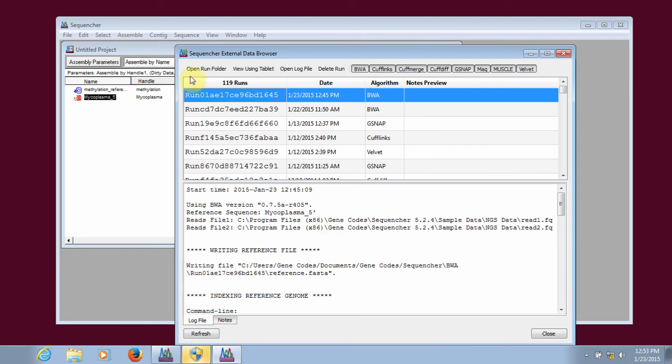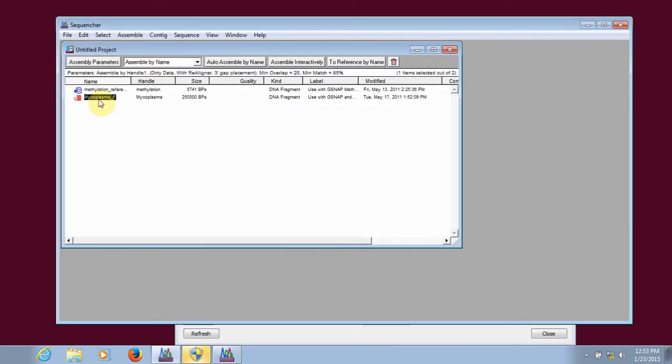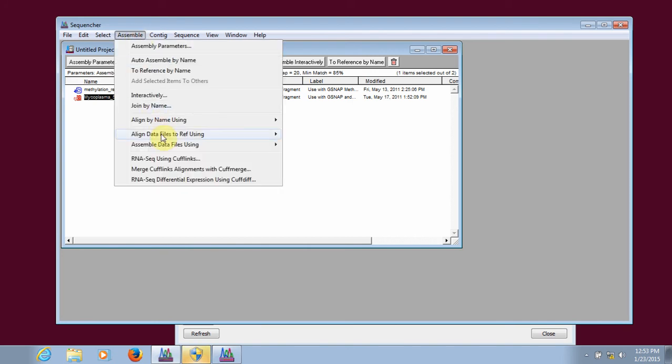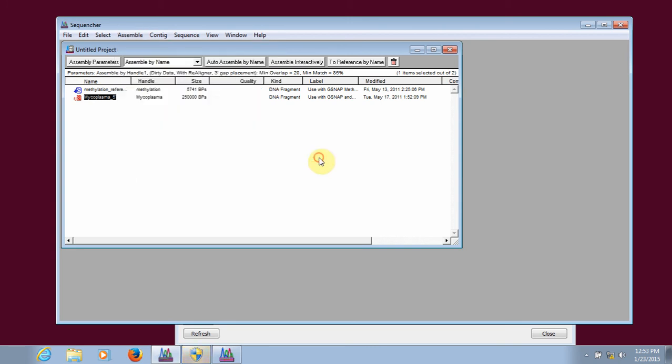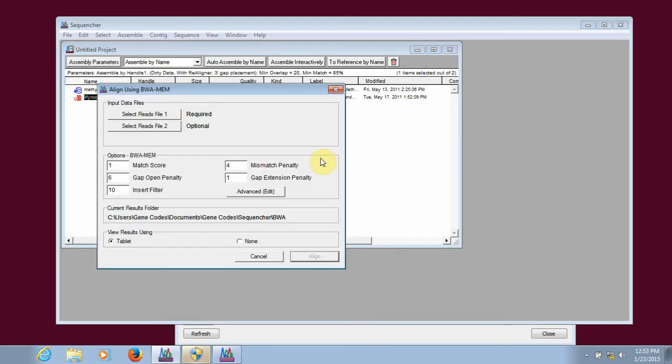To align, you highlight the reference sequence, then you go to Assemble, Align Data Files to Ref Using, and select the algorithm which you want to use. I've selected BWA MEM, but the process will be basically the same for MAQ or GSNAP.